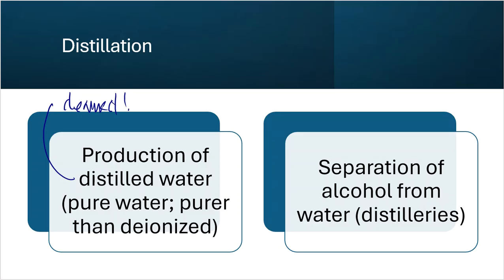For the most part, though, it should be deemed as safe in order to drink, but still it's an alphabet soup. There's things that are there. There's things that need to be purified. It is not the cleanest that it can get. So distillation will help take care of much of that.